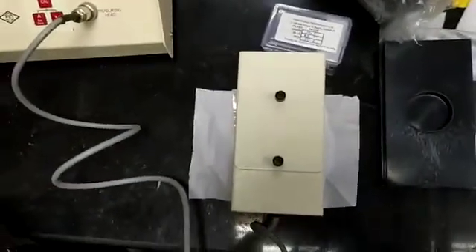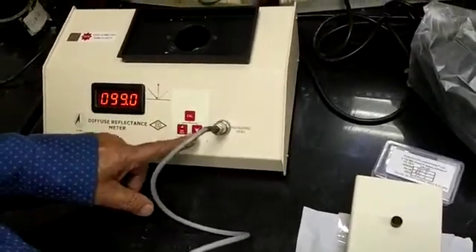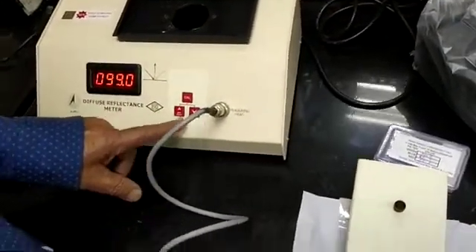Place this head on the zero cavity, then on the MG block. The reading is 99. If it is 99, you can set it with the help of the increasing and decreasing e-pad.